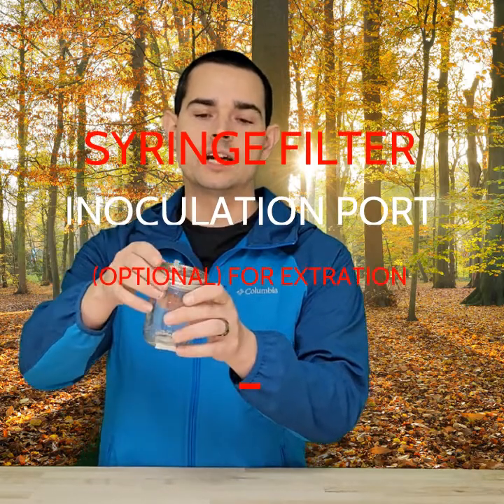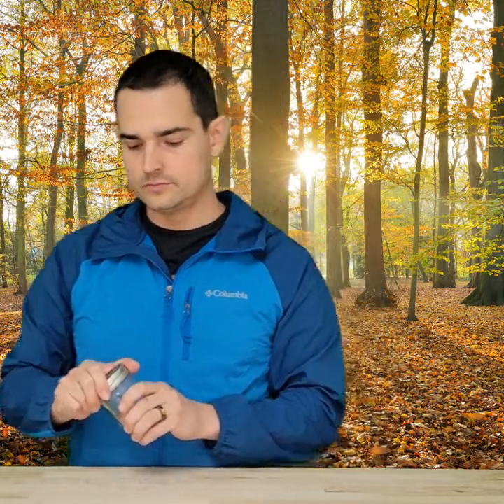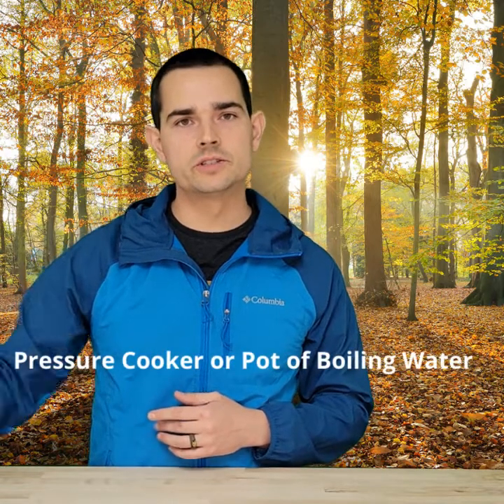Once you fill up your jar, you're going to put it in your pressure cooker or in a pot of boiling water and keep it in there for about 15 minutes. You don't want to cook it too much — the main reason being that you're going to get a lot of caramel or debris-looking particles floating around in your jar. Although that's not really going to affect your mycelium too much, if you have too much caramel floating around it's not going to be as conducive to a good liquid culture.